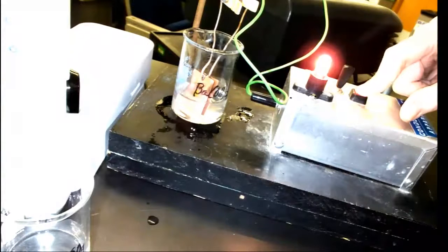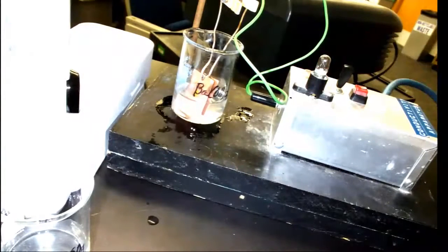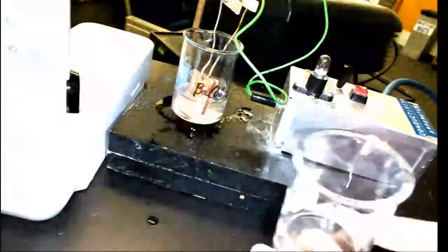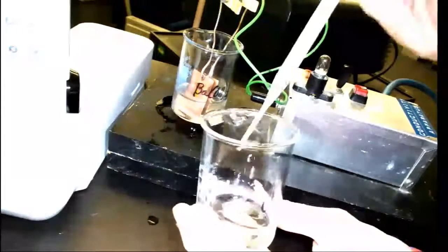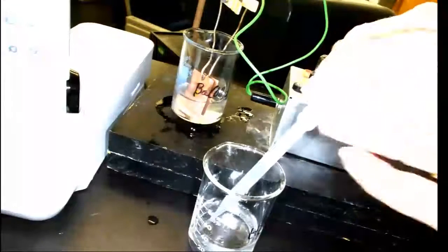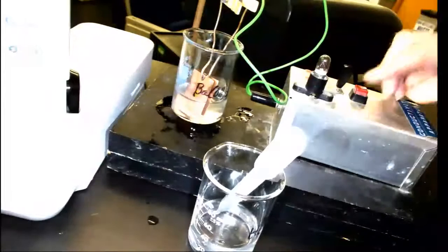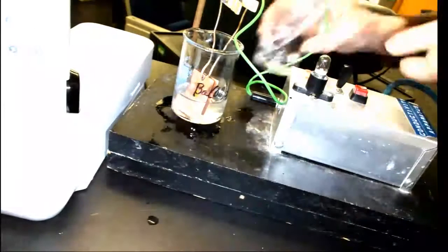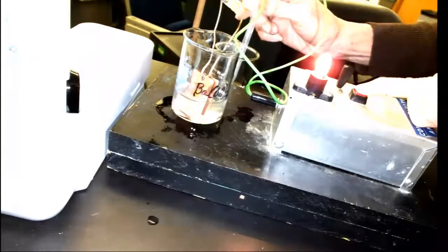Now, what I want to do is demonstrate what happens if I add the sulfuric acid to the barium hydroxide. This is going to take a few minutes, but we're going to be patient and see how that works. So the second beaker contains the sulfuric acid, and here's the label so you can read it. I'm going to add it a little bit at a time to the barium hydroxide solution with the electrodes in. I've got to hold my hands in the right spot. Good. The light bulb is going to glow, and we're going to add sulfuric acid to the barium hydroxide.